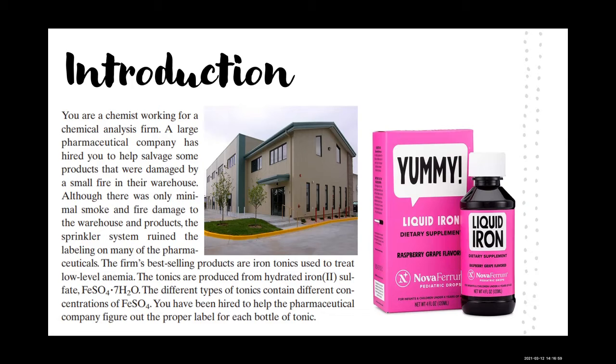A large pharmaceutical company has hired you to help salvage some products that were damaged by a small fire in their warehouse. Although there was only minimal smoke and fire damage to the warehouse and products, the sprinkler system ruined the labeling on many of the pharmaceuticals.